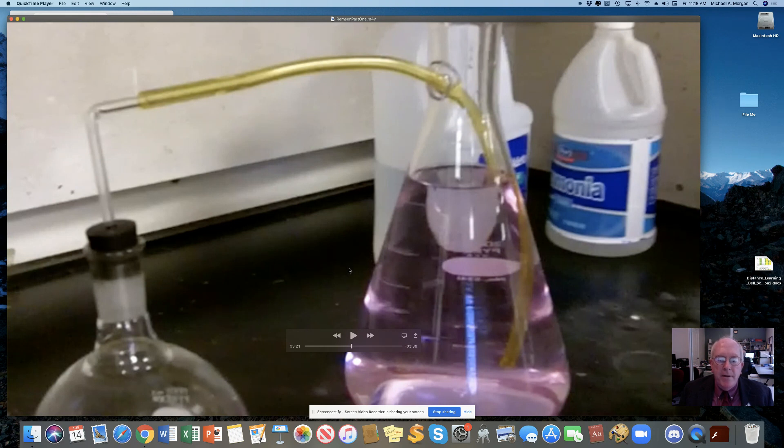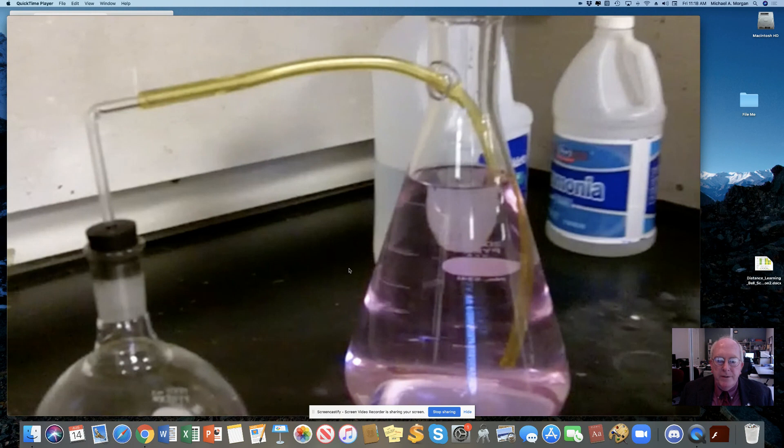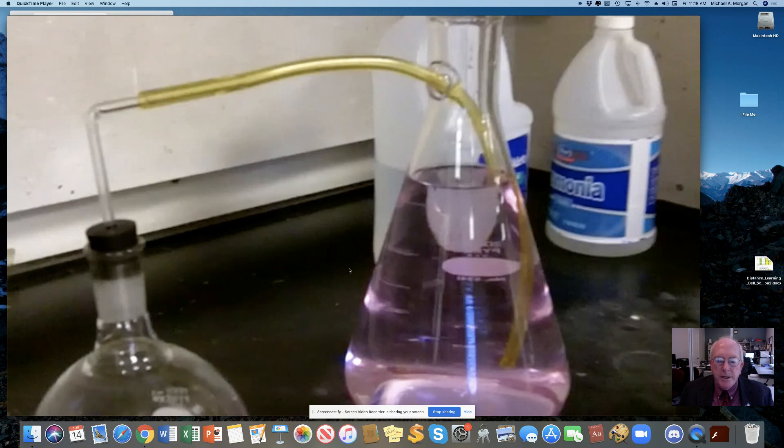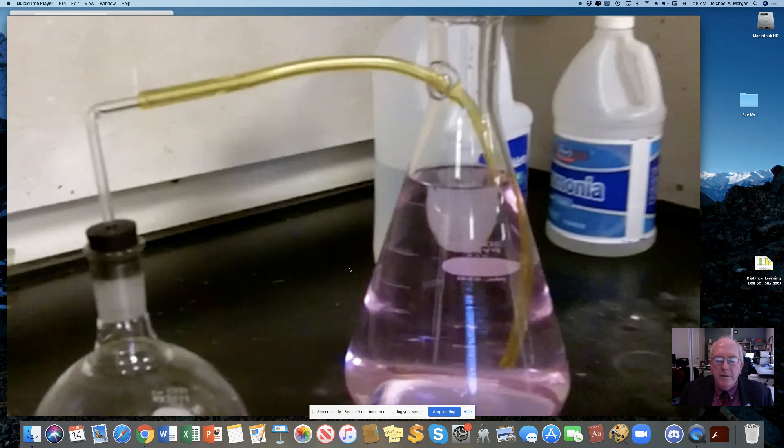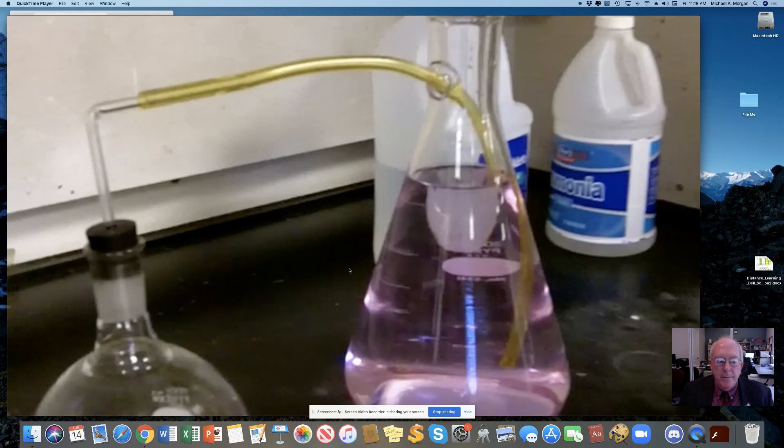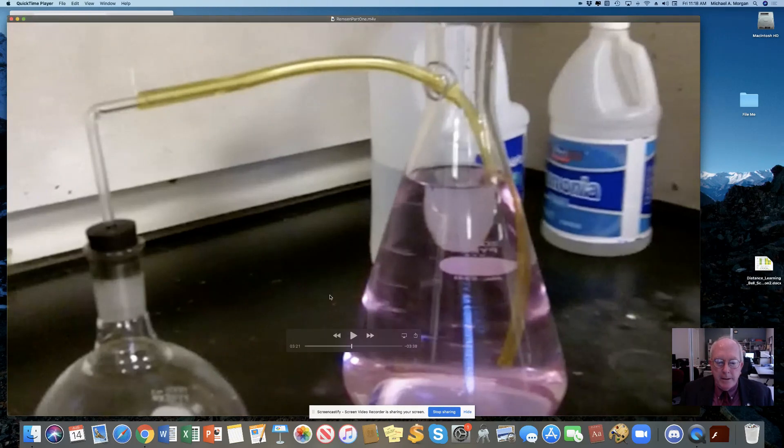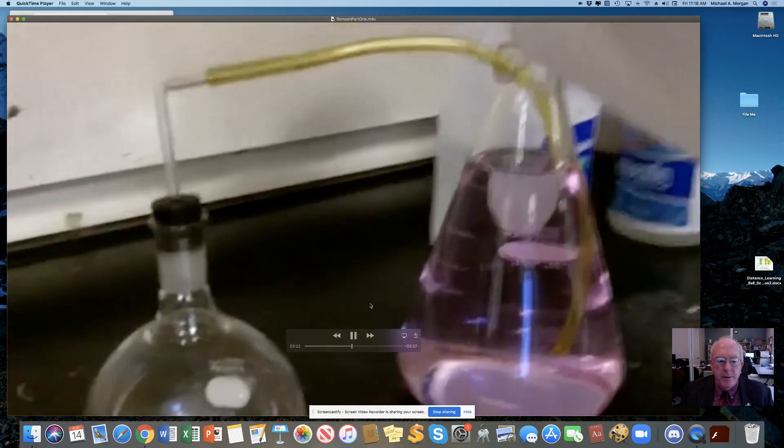And what we have here on the right side is a big flask, it holds about four liters, put some water in it, some household ammonia, you can actually see that there on the screen, and a little bit of acid-base indicator that made it turn pink. Okay, now on the left side, we have a round bottom flask. Let's start playing here so you can get a better view of it.